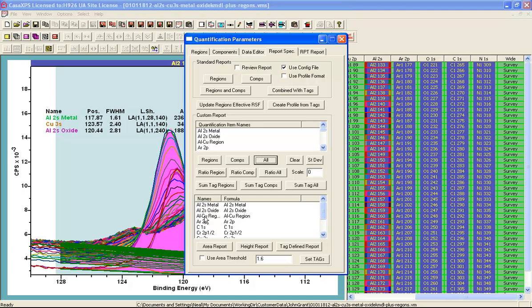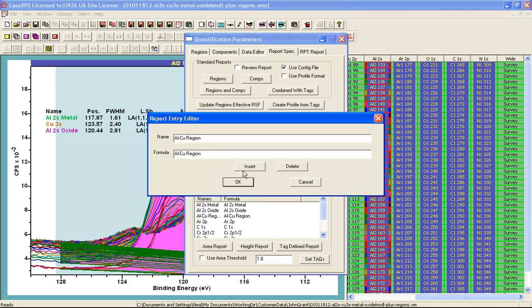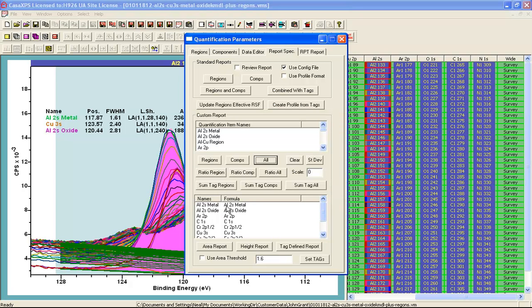So I am going to delete this by right clicking and then clicking the delete button and so I eliminate the region that was gathered from the aluminium 2s spectrum as indicated here.